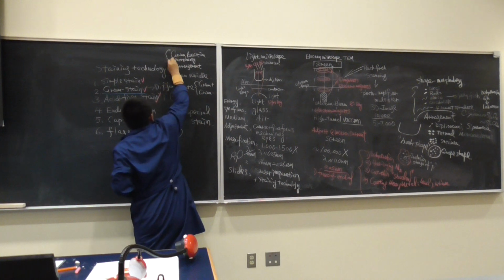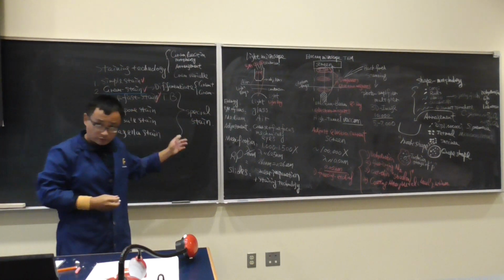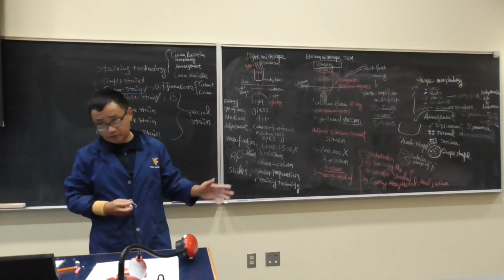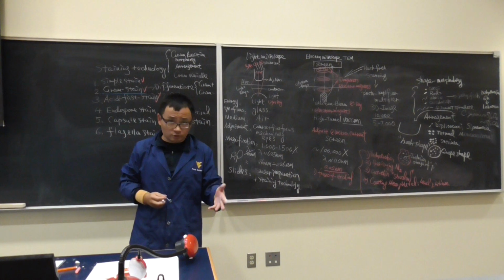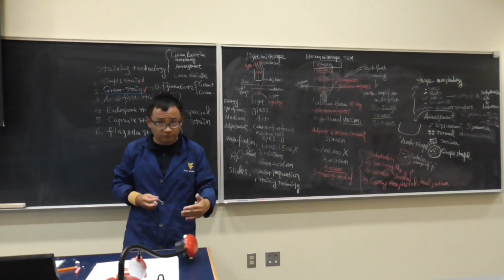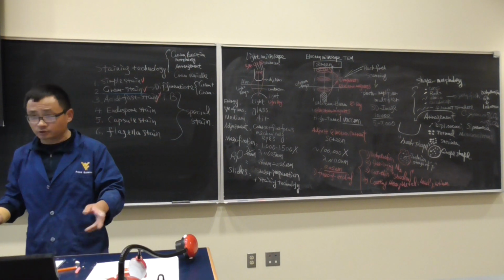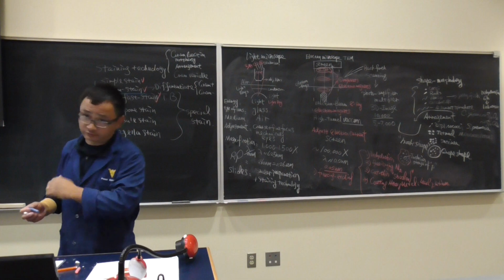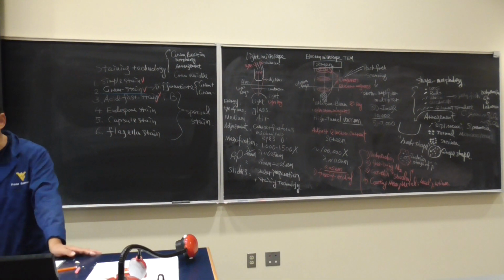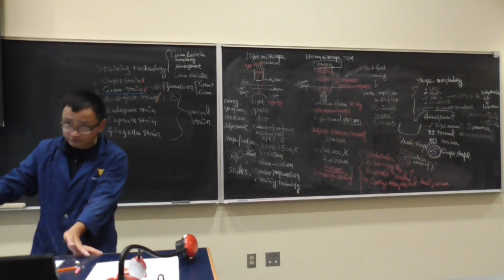So these are the 3 major items to record for gram stain results: gram reaction, morphology, and arrangement. So make sure in your lab notebook, you have those 3 important pieces of information after you're done with the gram stain. Not only gram positive or gram negative. Okay? That's important because you see in all these examples, the shape and arrangement very typically correspond to most of these pathogens.